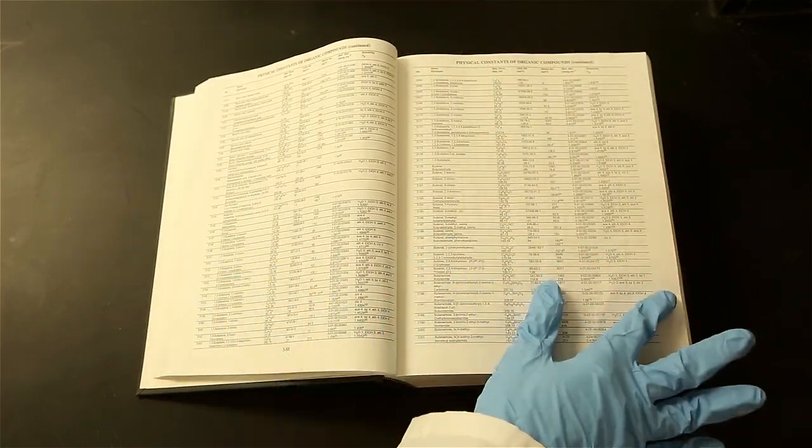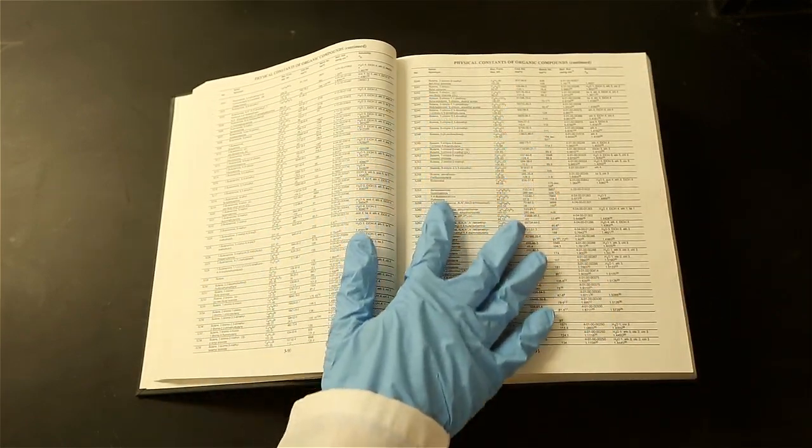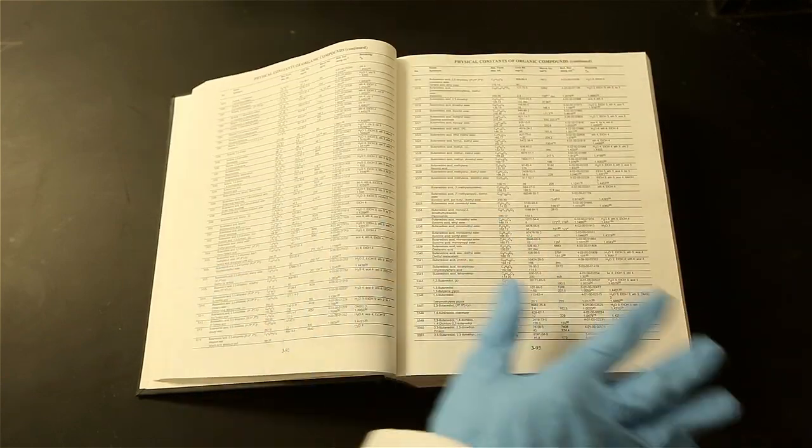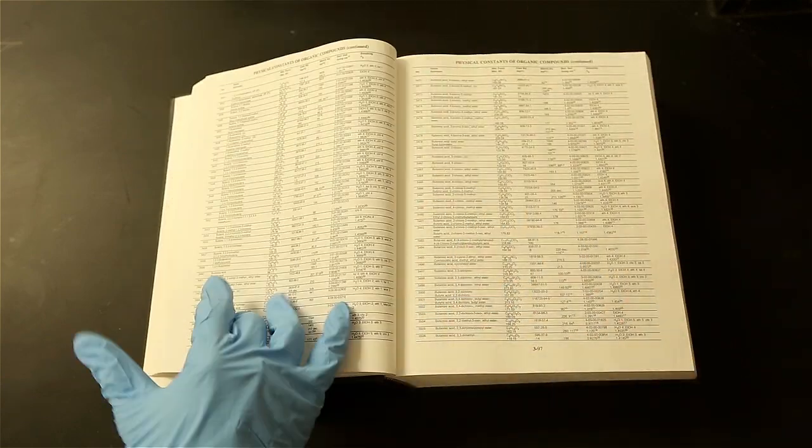Generally, a pure crystalline organic solid will have a melting point range of 1 degree. A depression or broad range serves as an indication that your sample is impure.